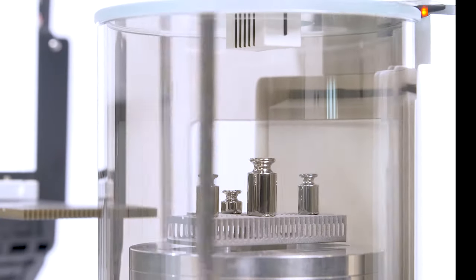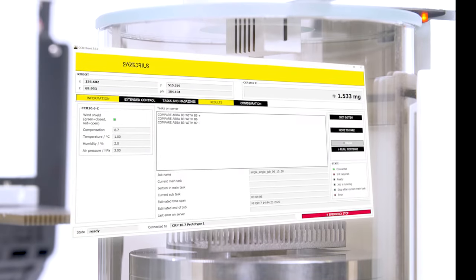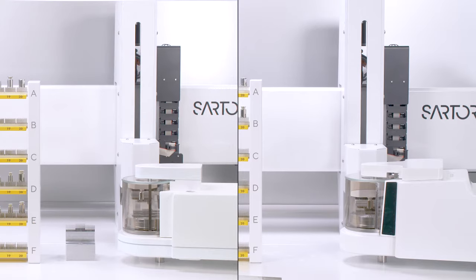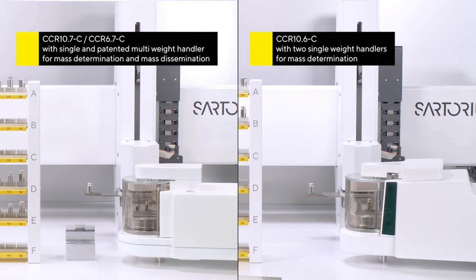The climate sensor integrated into the weighing chamber guarantees the most accurate correction for air buoyancy. Whichever application you may require, choose your model now.